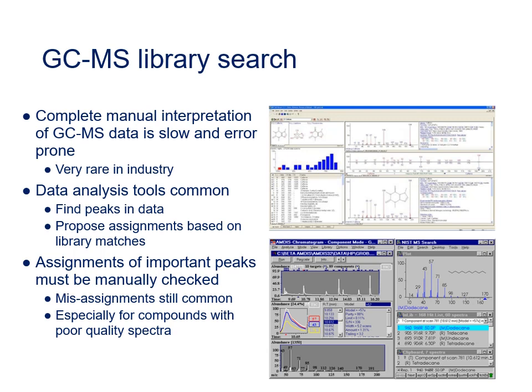Misassignments are common, often between structurally similar molecules or molecules that all fragment down to identical small fragments. Consequently, the identities of all important compounds should be manually reviewed in the first instance. If an expert user agrees with the possible identity, then the next level of confirmation would involve purchasing or synthesizing that material and subjecting a standard solution of it to GCMS analysis to confirm both the retention time and the resulting mass spectrum, and only then would assignment be confident.